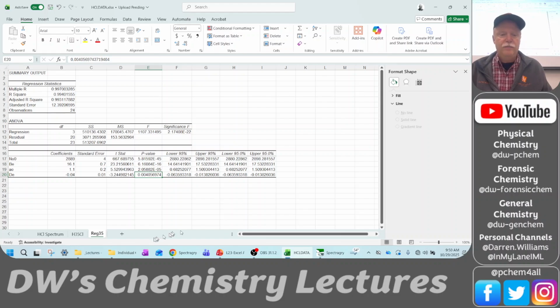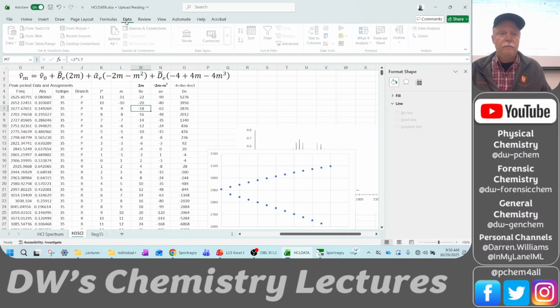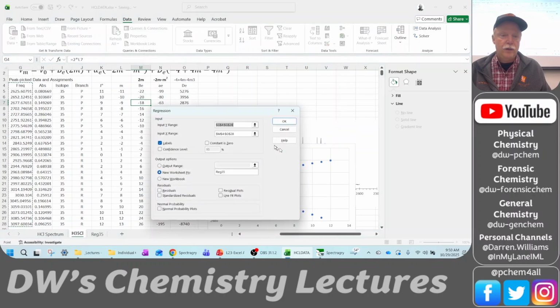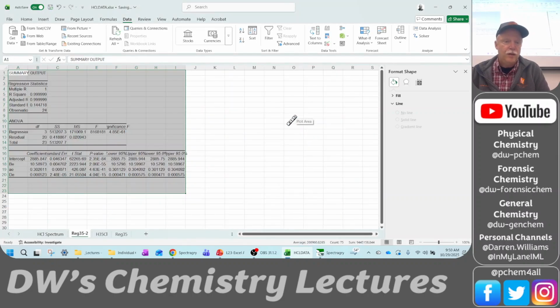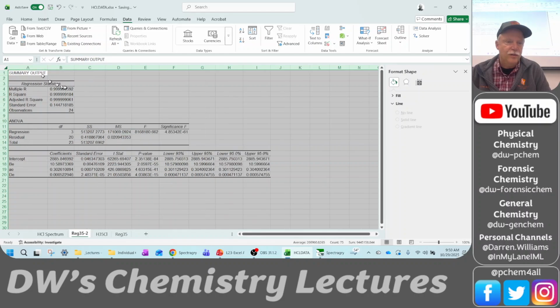Okay, dang it, we're out of time. So we'll do the regression and we'll have a nice happy ending. Okay. So we go to the data tab, data analysis, go to the regression. It should have the same things that's already selected, frequencies, yeah, that's all good. We're going to call this reg 35 2. Okay, so we can compare the two. Yeah, that's what you're looking for.